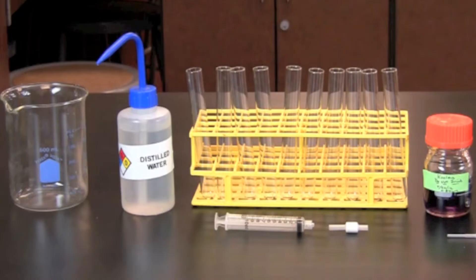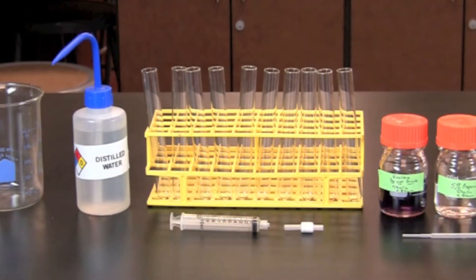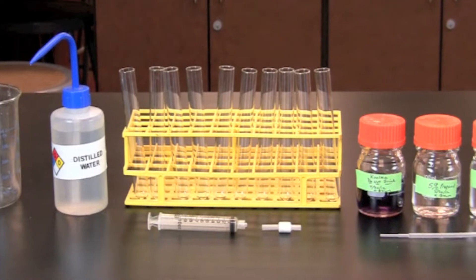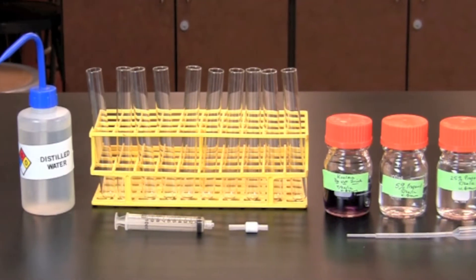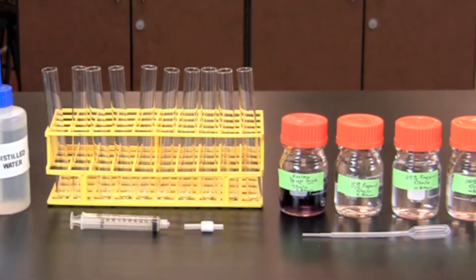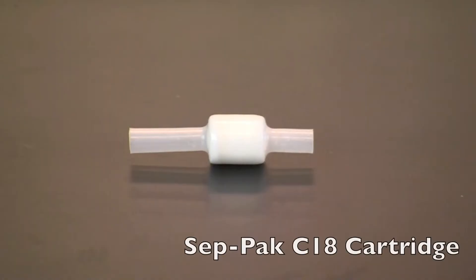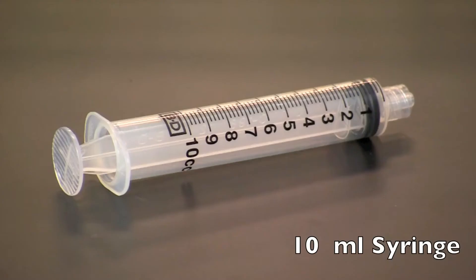Prior to starting this lab, you will need to obtain a beaker for waste, a squirt bottle with distilled water, 10 clean test tubes, a mixture of Kool-Aid, 5% and 25% 2-propanol solutions, and concentrated 2-propanol. You will also need a CEPPAC C18 cartridge and a 10 ml syringe.